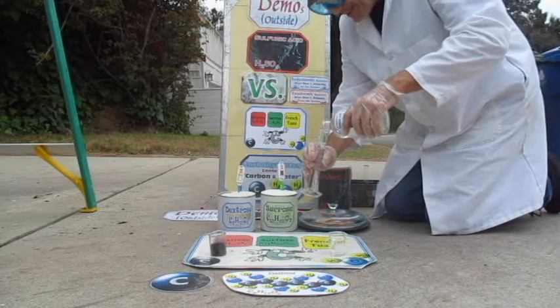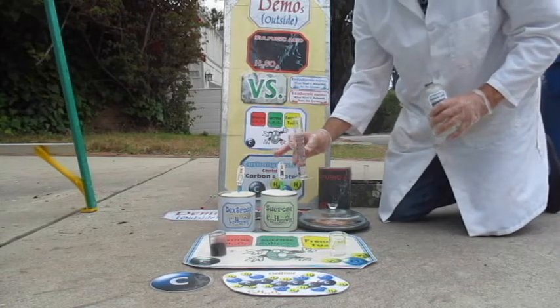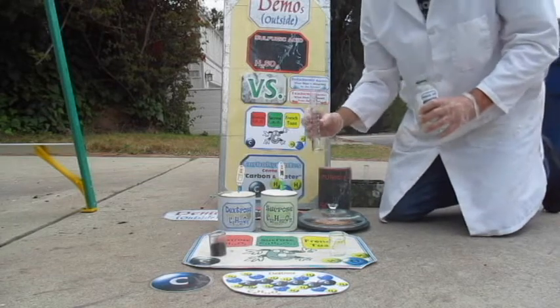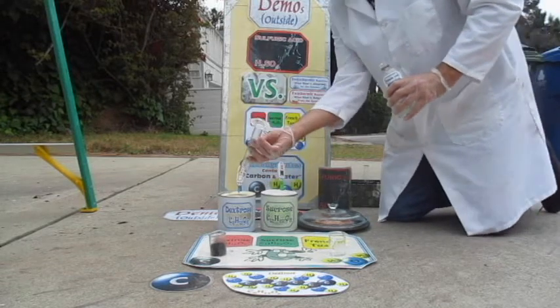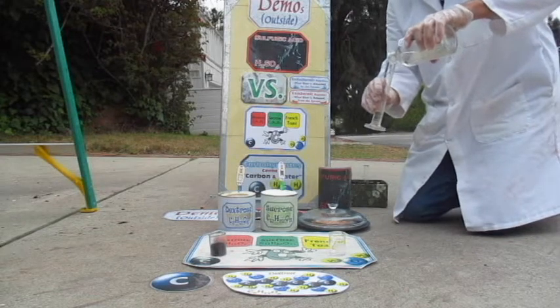And we'll see what happens to the temperature, and we'll see if we can see the carbon that's in there. I'm gonna do that one, then start this one right away. So keep an eye on the first one, 50 milliliters, that's quite a lot of H2SO4. And I'm just gonna go right ahead and start the second one, just to save time.